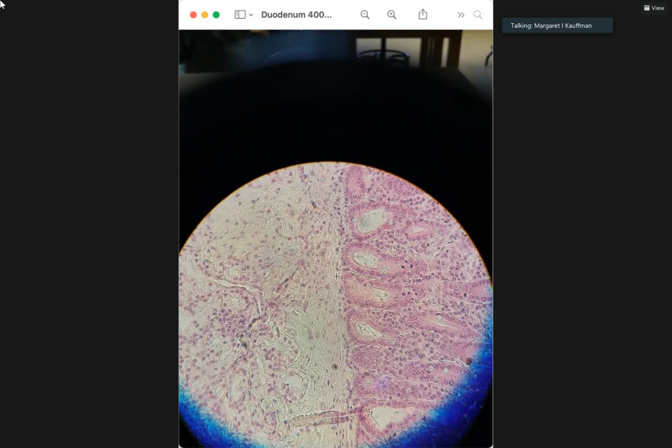Now, here, unfortunately, the pink isn't very evident like you could see on the other slide. But I hope you can see there's kind of a texture here where there's lines going parallel. That's the muscularis mucosa. It sort of ends where these nuclei suddenly start showing up. A little hard to tell where it ends here, but it at least goes down to this level and then comes up here and over here. I can see the border of the muscularis mucosa. So it's almost a texture you're looking for rather than a color, unfortunately, in this picture, because I must not have picked an area where it was very darkly stained.